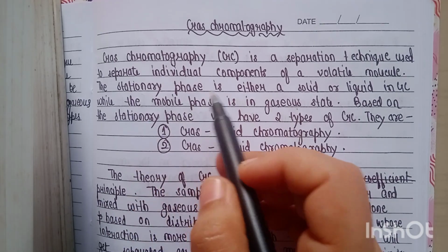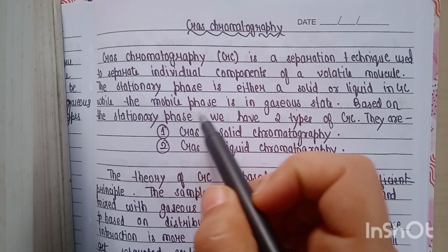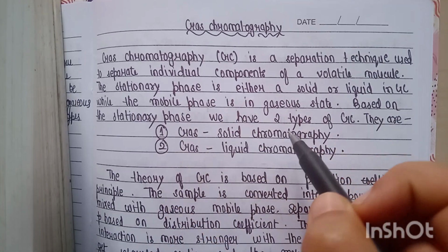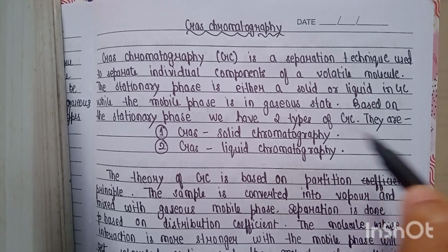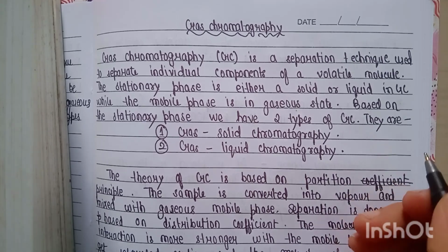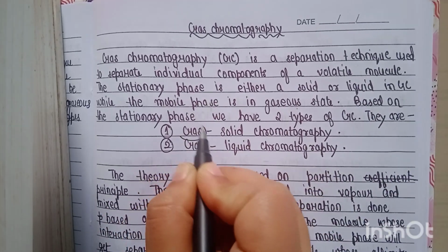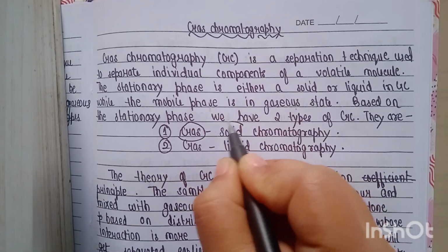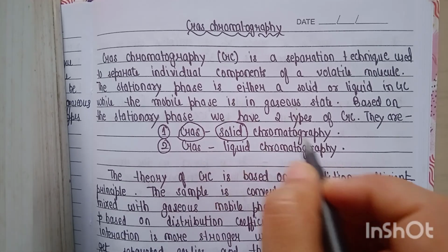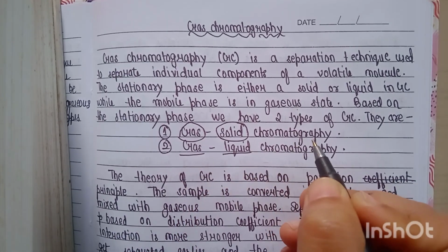The stationary phase is either a solid or liquid in GC, while the mobile phase is in gaseous state. Based on the stationary phase, we have two types of GC, and they are gas solid chromatography and gas liquid chromatography. In gas solid chromatography, gas is the mobile phase and the solid is the stationary phase. While in gas liquid chromatography, the gas is the mobile phase and the liquid is the stationary phase.